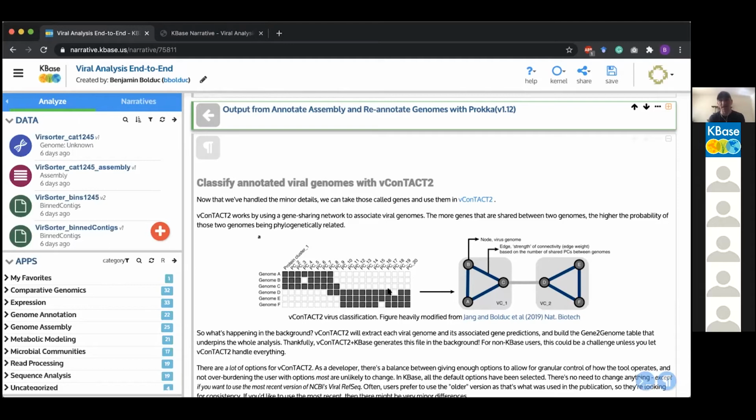If you're sharing 9 of your 10 genes, could be the same species, maybe not, or you're definitely in the same genus. If you share 7 of those, maybe you're in the same genus, or maybe you're in the same subfamily.